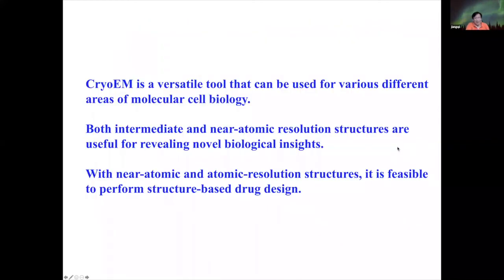With all this, I'm ending this talk. So I have showed you that Cryo-EM is a very useful, very versatile tool, delivering structures in either the intermediate resolution range or at near atomic resolution. In both resolution ranges, the structural information can be used for revealing important biological insights. And using the near atomic resolution structures, it's feasible to perform structure-based drug design.